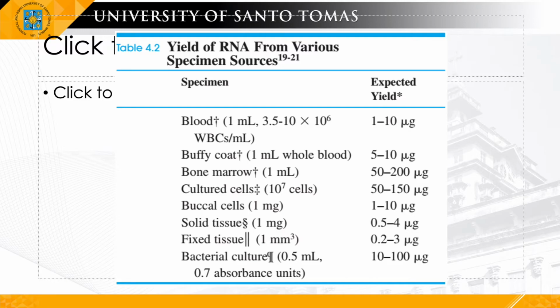Again, it's very important to consider specimen handling, because as I previously discussed, specimen handling affects RNA yield, especially with RNases from fingers. Also, as in the discussion with mRNA, usually polyadenosine mRNA will result in a much lower yield.